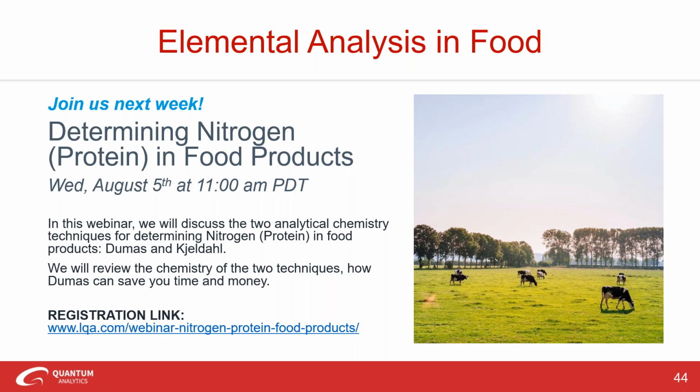Awesome. And then, is a benchtop XRF accurate and sensitive enough to be used to monitor nutrient genotypes for biofortification breeding? Whoa, that was a mouthful.